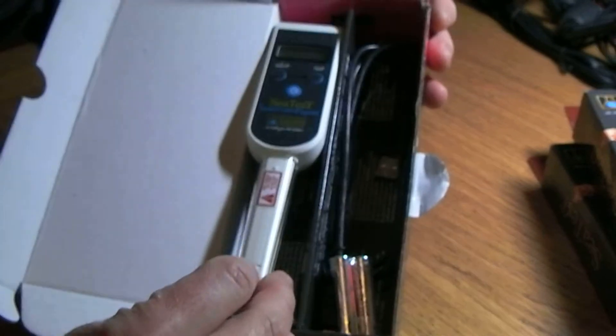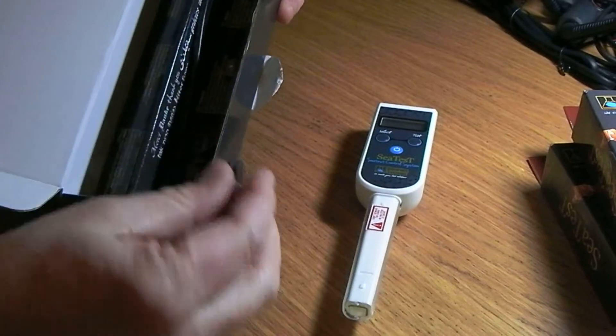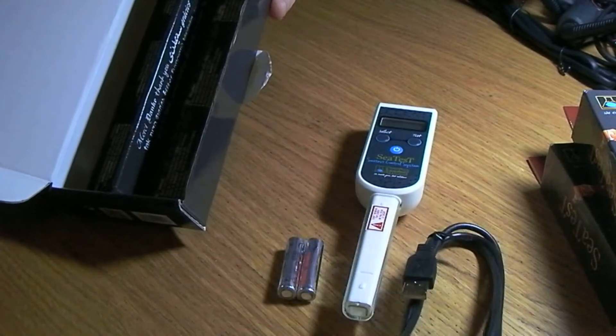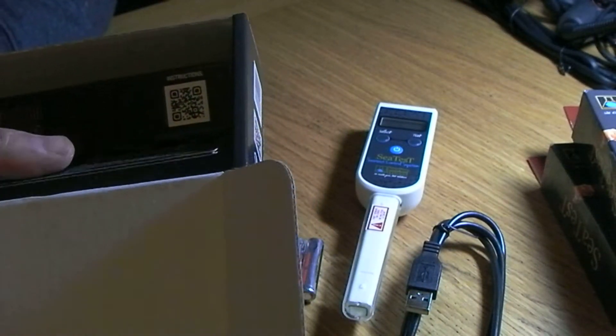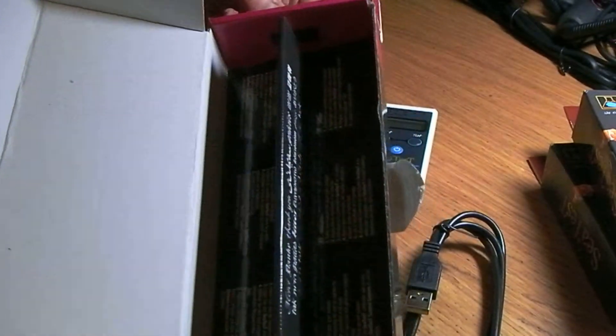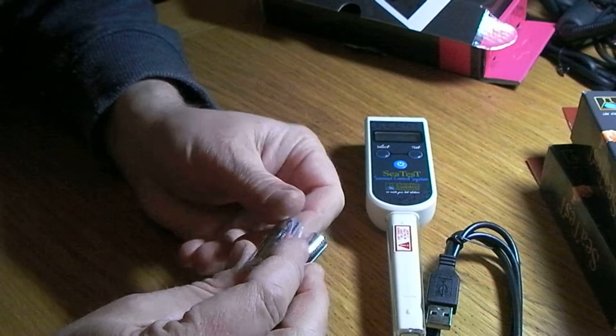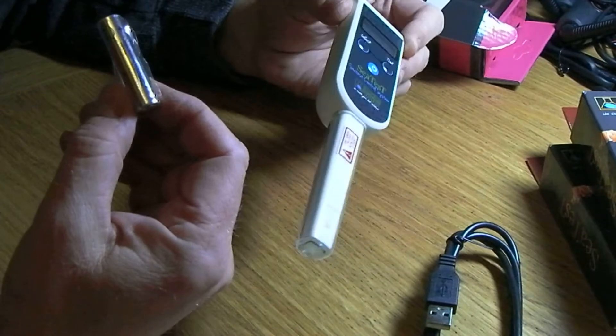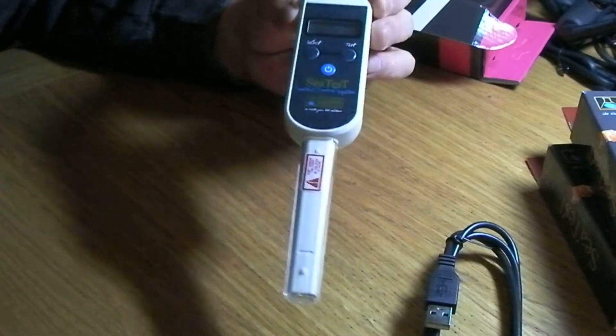I was quite surprised when I opened it to find absolutely no instructions or anything whatsoever. All you've got is the main unit, a couple of cheap nasty batteries, and a USB cable. There are QR codes so you can just download the instructions. It's never nice to see cheap batteries in any unit for that price. I would much rather have seen some Duracells or some higher end batteries.